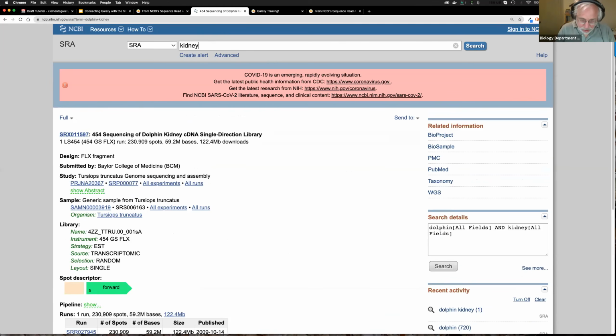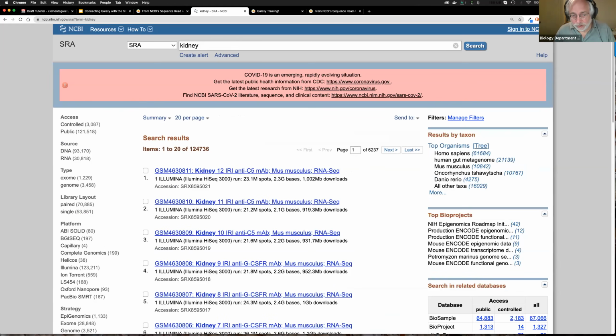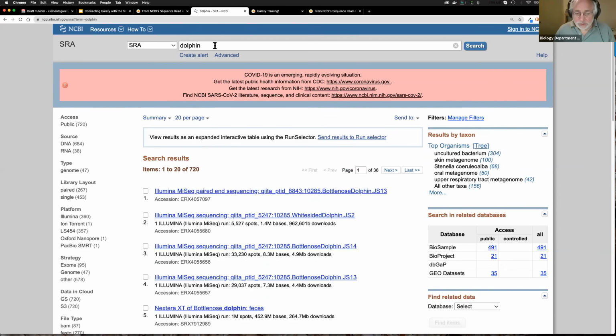If I type kidney, I go back and there we go. Now I've got 124,000 entries. So a lot more than I did for dolphin. Okay, dolphin, oops, if I could spell. So if I go back to dolphin, I have a mechanical keyboard, which is why you can hear me type. I get 720. Okay, now there's a bunch of things we could do, so I type dolphin, I type kidney.